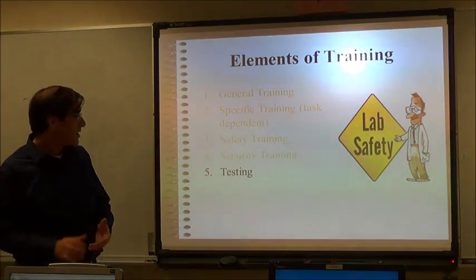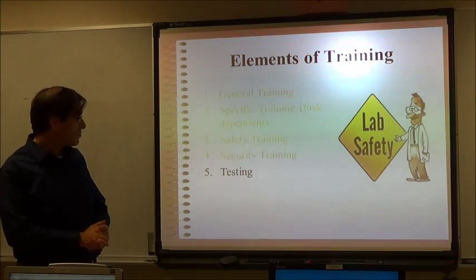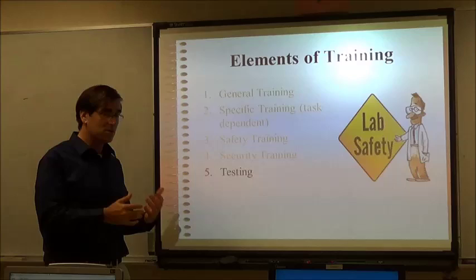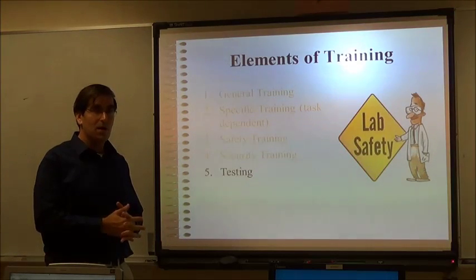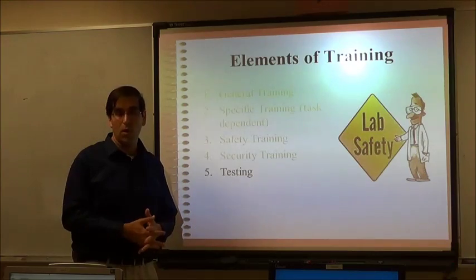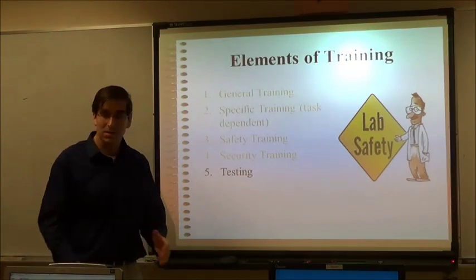And then on top of that, in all cases of training, you need some sort of testing. This will just show whether or not you've understood the material and whether you're okay to work in the lab space. And this will certify you for 1 year from the date of your training and testing.